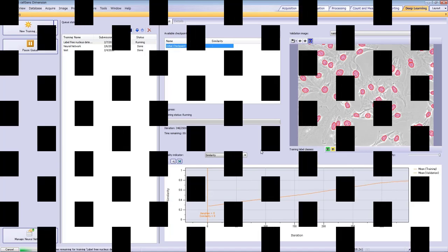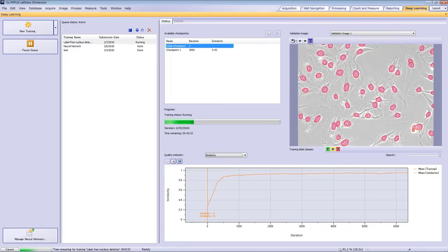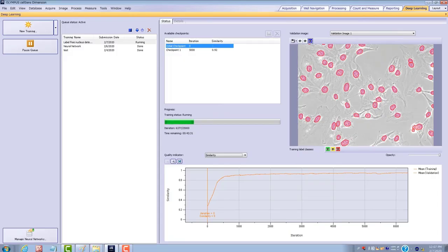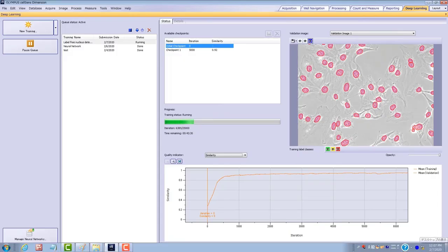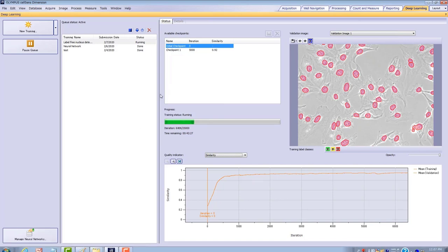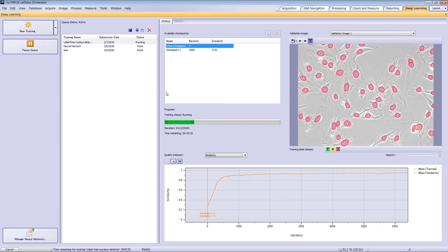When each iteration finishes, a checkpoint is created. You can check the quality of the neural network by validating the data at each checkpoint.